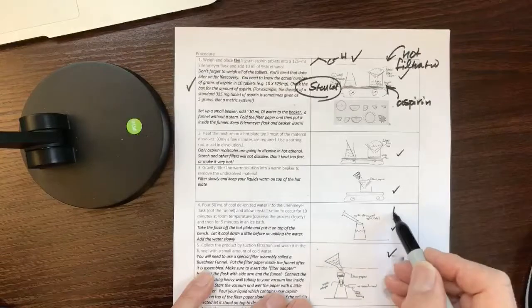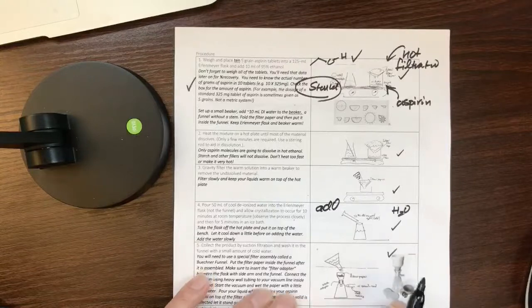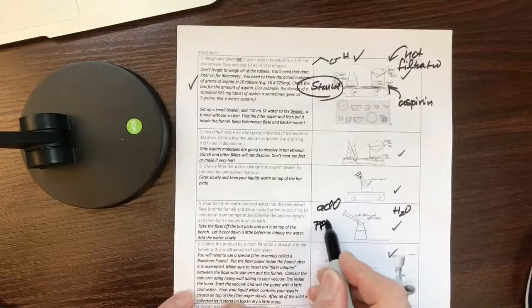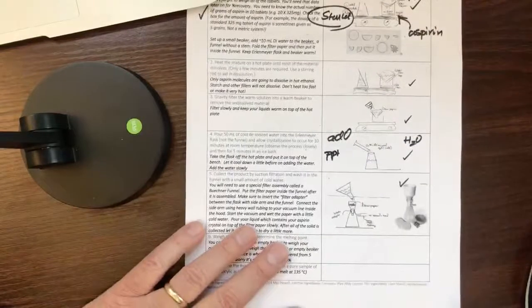So here we add water. This is aspirin inside the ethanol, right? When you add water, the aspirin, what we call precipitation, precipitates out. Then I'm moving the paper a little bit higher.